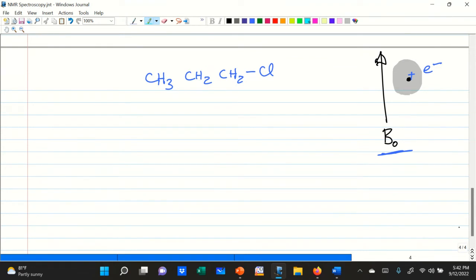And the interesting thing is, if we say all hydrogens are shielded, here comes the second aspect. All hydrogens are not equally shielded. If I show you, for example, these hydrogens in this molecule, of course, they are highly shielded by their own electrons, right? However, the hydrogens that are next to this chlorine are shielded differently. Why? Because chlorine pulls electrons, therefore the shielding effect on these hydrogens is going to be less, because electrons are pulled by this chlorine being an electronegative element.